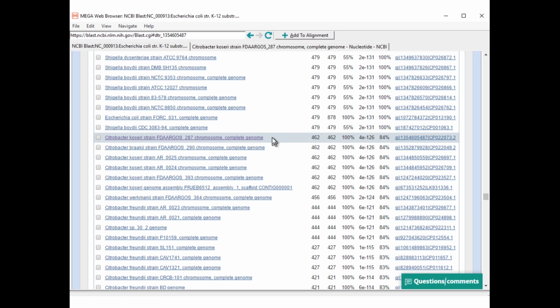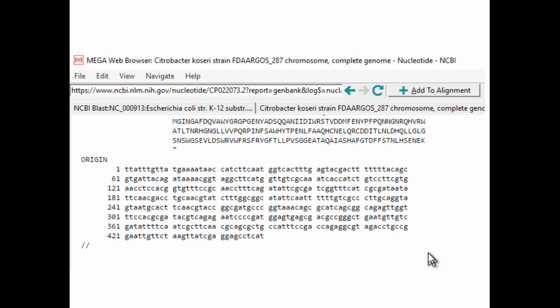So I go through the same things. I click the thing, I go down, click the GenBank, bring up the file, look at the bottom of the file, and what I see at the bottom of that tab is TTA, TTGTA, and it ends with CAT. That does not look like a coding sequence to me. And if you look at it, you say, well, that's the reverse complement of the coding sequence. At least it looks like the reverse complement of a coding sequence.